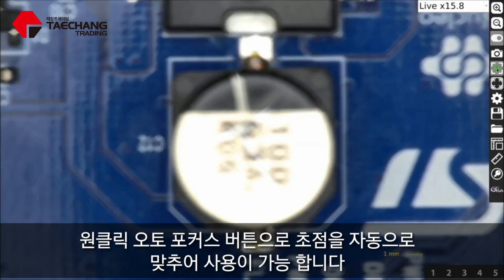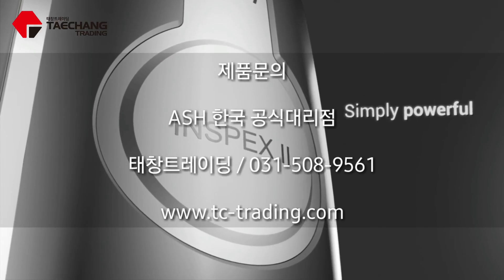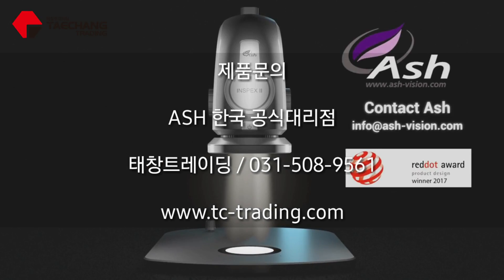A one-click autofocus on-screen indicator makes it suitable for a wide range of applications. Simply powerful — INSPEX II. Visit ash-vision.com now or contact ASH to learn more.